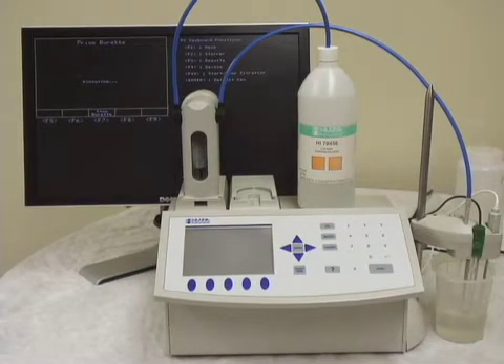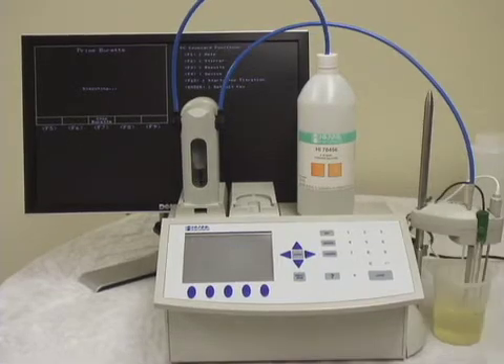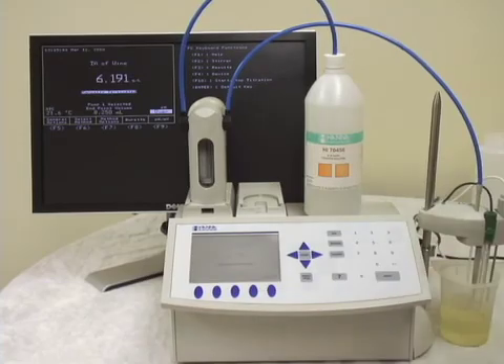Okay, we're just finishing up our prime of the burette. Once it's finished, we'll go back to the prime burette menu. There we go — burette is primed and we are ready to start testing. We're going to escape out of here and on to our next test.